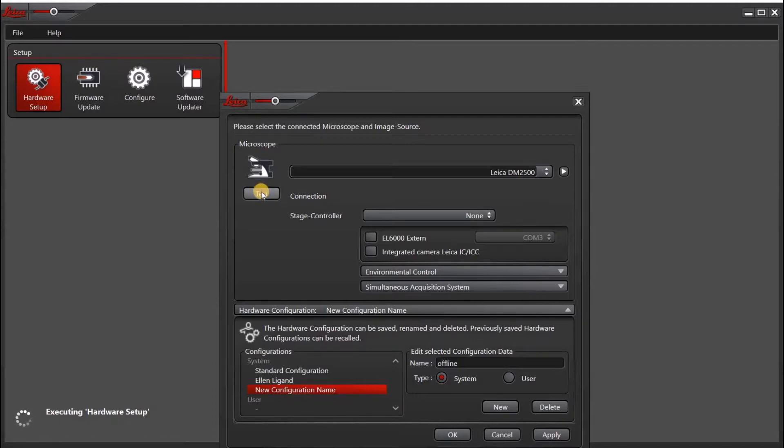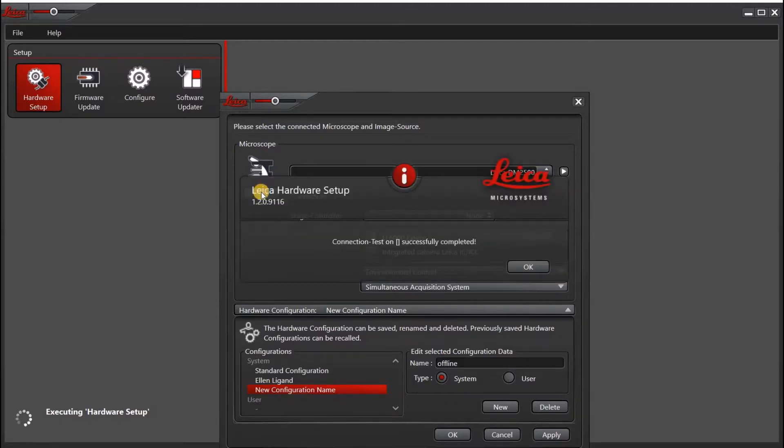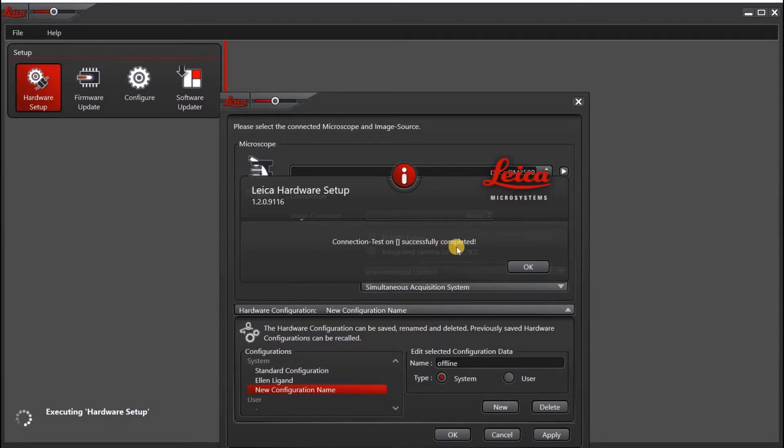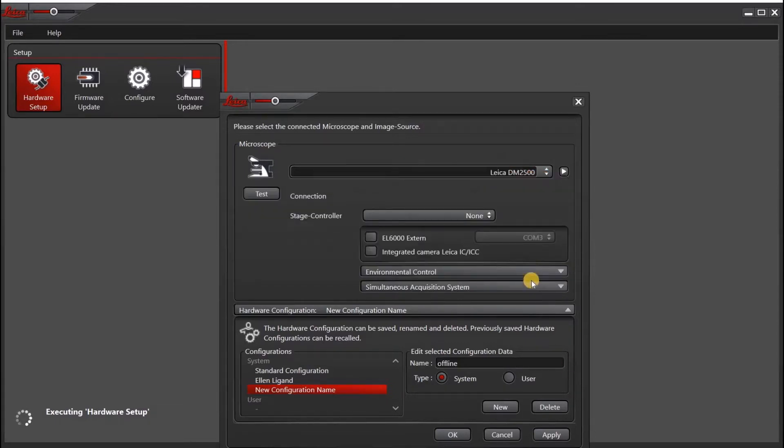Then as an option, you can click test, and it will check the connection. And there is no connection, so it is successfully completed. Click OK.